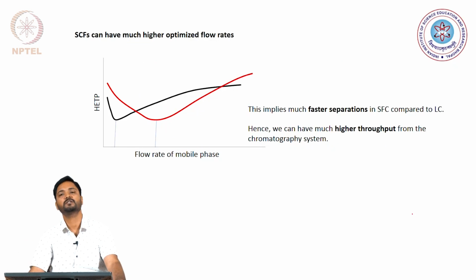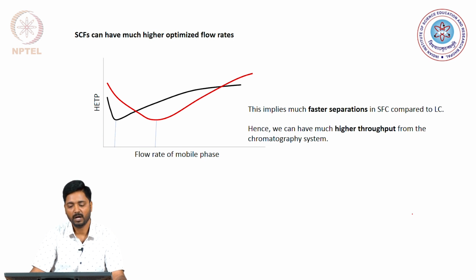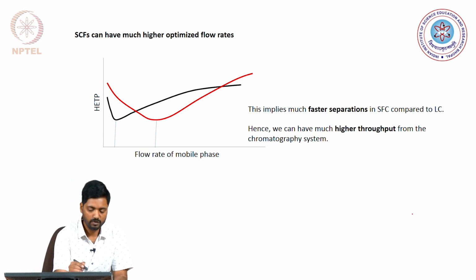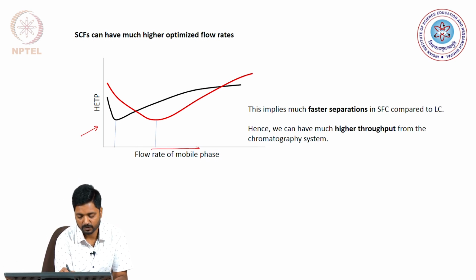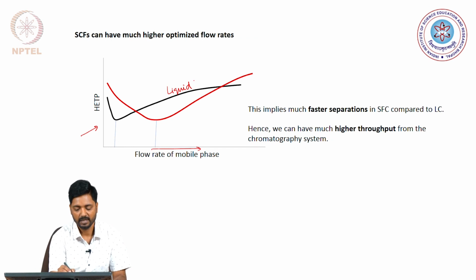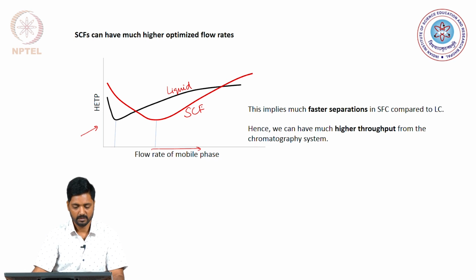So, let us move forward and compare how the improved flow rates of supercritical fluids is advantageous to us. So, here I have plotted the change in the plate height with the flow rate of the mobile phase for the liquid chromatography and for supercritical fluid chromatography.